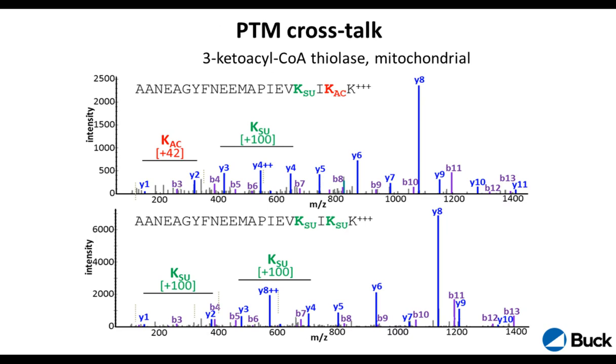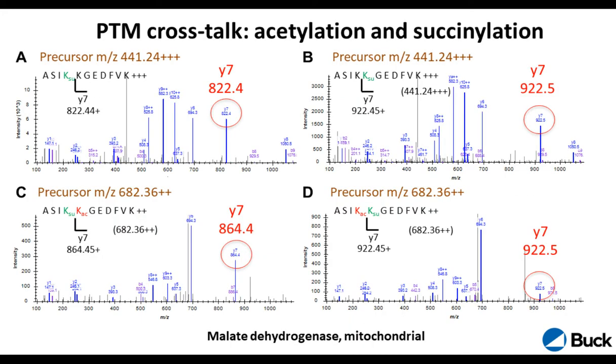In fact, in the data, it was quite interesting. We would get all these spectra here, for example, where we would have mixed species. Maybe there was one peptide that we saw both acetylated as well as succinylated. But we saw the same peptide also where both of these lysine residues were succinylated. So we saw all kinds of really interesting, different portfolios of acylation sites on one and the same protein. So we can really try and look at crosstalk of PTMs here.